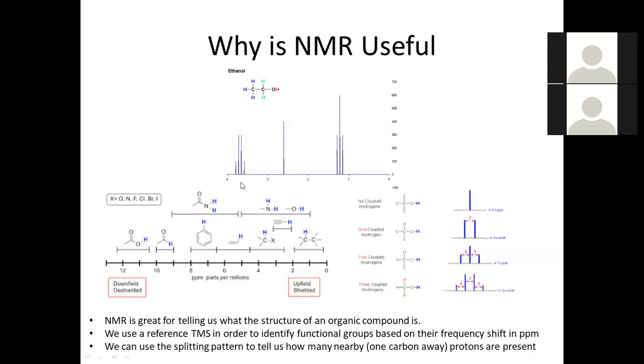Okay, so whenever we get a spectrum like this, usually we won't know what we're looking at, but all of the worksheet problems have the structure already. We're trying to be a little bit nicer to you because this is your first introduction to this, plus you're going to get tons of experience with this in organic anyway. But essentially, this is sort of what you'll see. They'll give you some peaks, and they'll give you the molecule, right? And it's your job to assign which hydrogens in a proton NMR go to which peak, right?